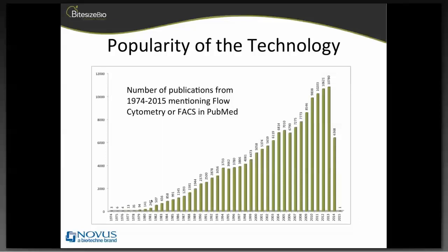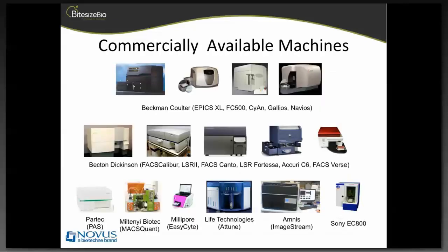Here are some of the commercially available machines. There were machines that you found in the clinical lab, there were machines that are found in the research lab, and there were also machines that have varying degrees of complexity.